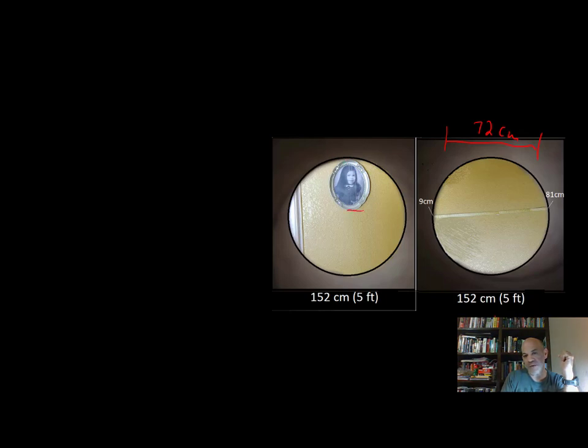So say, well, that's one picture. So visually I can estimate. If I put another one and lined it up right by there, that other one would come to about right there. Okay? And so that would be my second picture. So that's 2 pictures. And then the next one would actually go off the field of view. Okay? And so when I do that, it might be somewhere about right there. So you're visually estimating this.